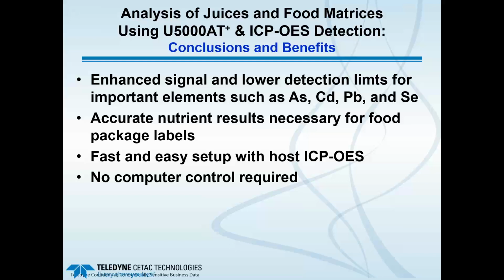No computer control is required, so there's no software to load onto the host ICP computer. Once it's hooked up and everything is at temperature, you can start pumping samples. And as I showed you in the picture, it's one button operation. You simply press the yellow button on the front of the unit and the aerosol starts, and you can continue to pump samples. You don't have to do anything else to the ultrasonic nebulizer.